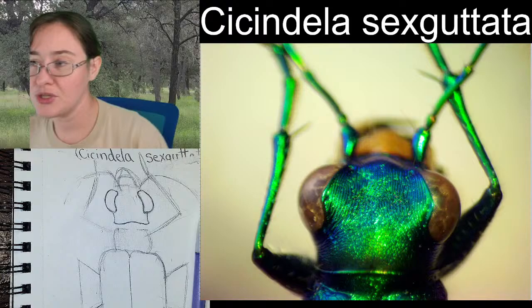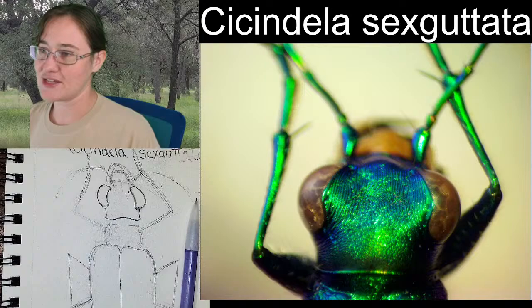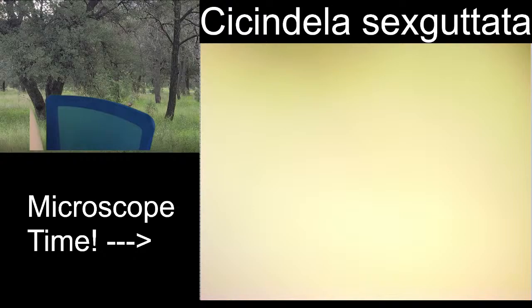We're going to be changing the angle of our specimen so that we have a better look at the mandibles. I want to draw the mandibles like they are up rather than kind of going down like this. Plus, if I angle our specimen a little bit, we'll be able to see more of the mouth parts. You know what we're going to do, actually? We're going to look at our specimen head on. Because I can't help it.